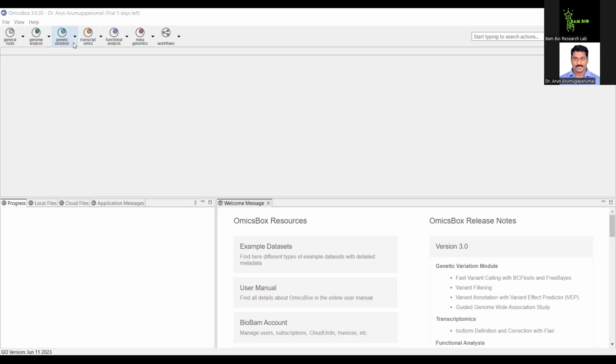The only thing is, here the number of genes is more. The output files which you get from a bioinformatics tool, you have to use either R programming, shell programming, or Python to organize the results. But these commercial software will organize the results for you. So your time will be saved. That is the only difference. But all the tools you can use outside also.